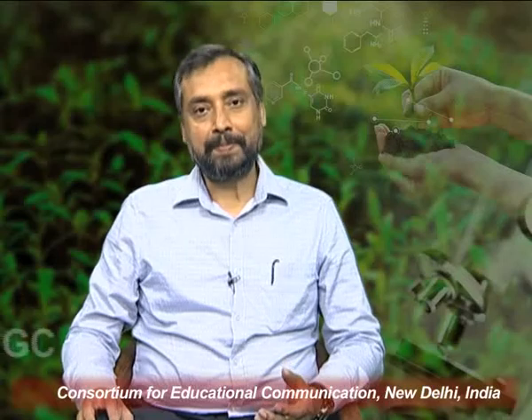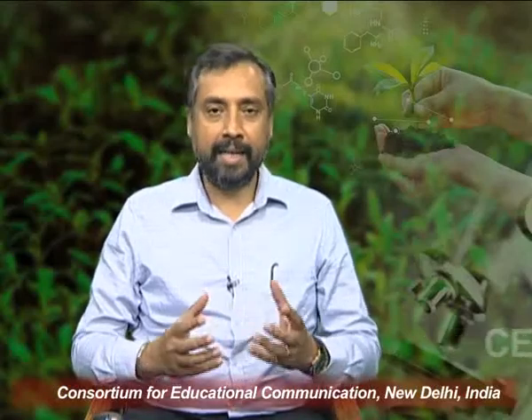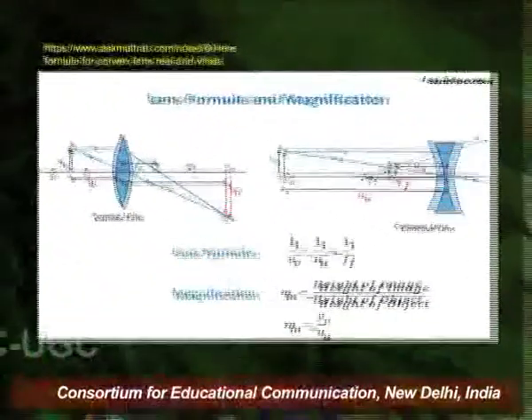Let us try and understand how and in which manner these two fundamental properties affect the magnification of the image and also the resolution of an image. So let us try to understand the magnification with the help of a schematic diagram.